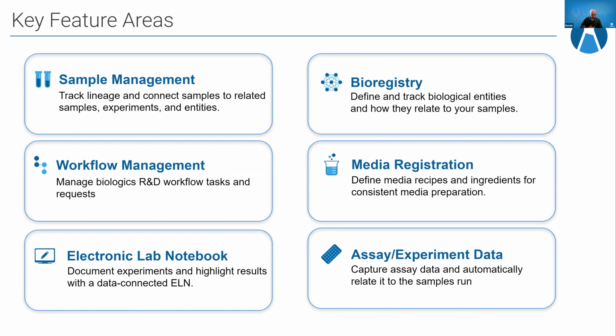Similar to our bioregistry, our media registration area enables you to register and track the raw materials, ingredients, mixture recipes that you are making regular use of, and produce batches, which are trackable like the other samples in the system, to help make your media preparation consistent.